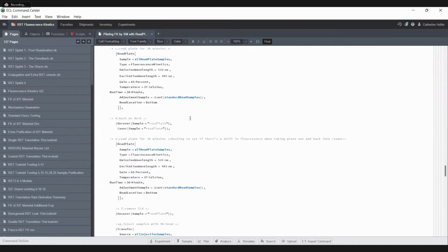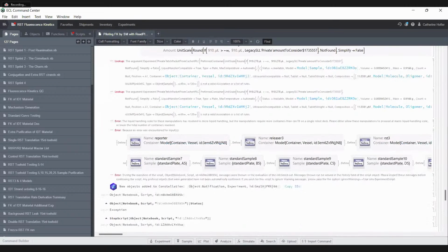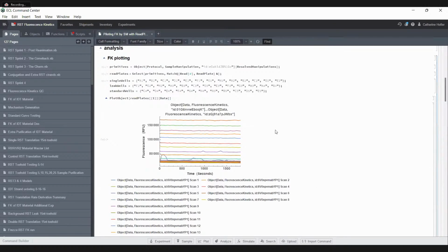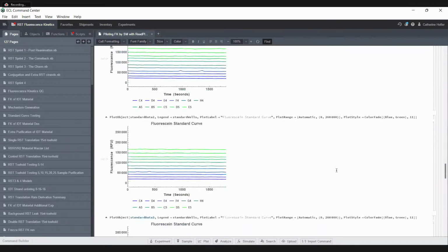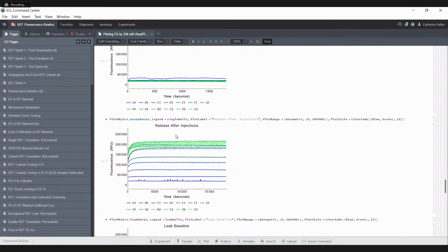I don't have the perfect example, but I have a realistic one, and this is the experiment that I was describing earlier, where I was piloting a new version of doing this experiment. So here's some raw data. Here's some fluorescence. We see fluorescence over time. Lots of different examples of those curves there. Here's my actual interesting reaction. I've added my releaser. I see an increase in fluorescence.